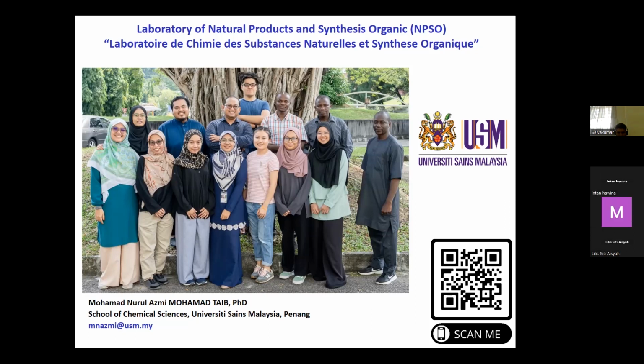If you see two sets of carbons, the first very intense and the second less intense or not intense, it means your compound is not pure. But you can still read the NMR by using HSQC, predicting which carbons represent your major compound. I think this is the way we use because two Fridays ago I worked with one of my colleagues from UM, and alhamdulillah within three hours we could solve the compound.